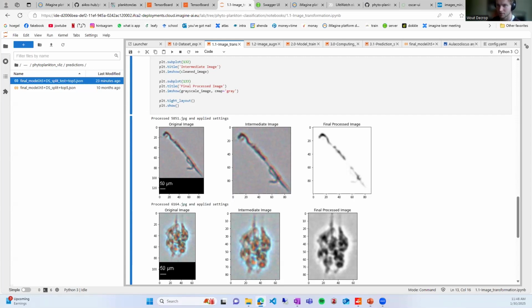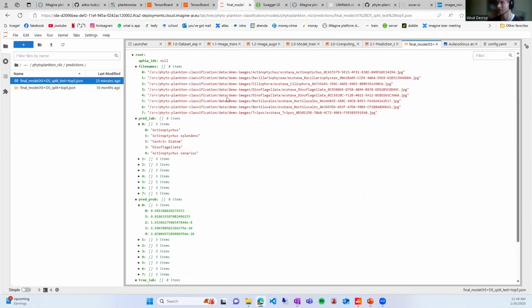So there's not been a notebook of this yet, but if you have the JSON file with the confidence ratios, if you export this, you can create, maybe you can just put the image and then the confidence ratio and its top prediction. You kind of have to do this yourself.